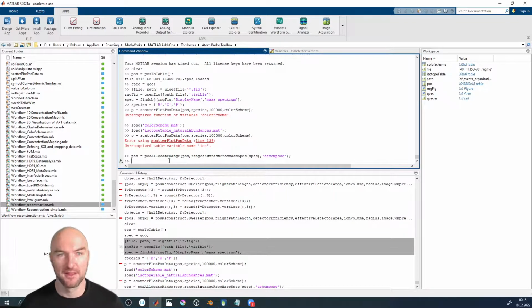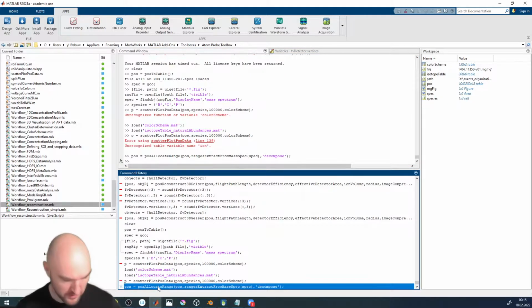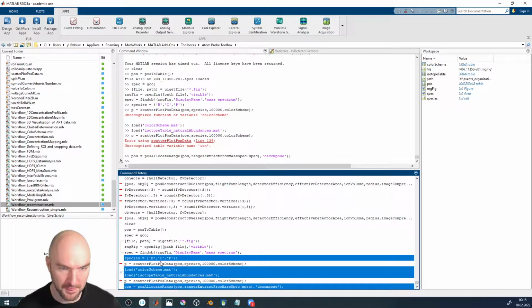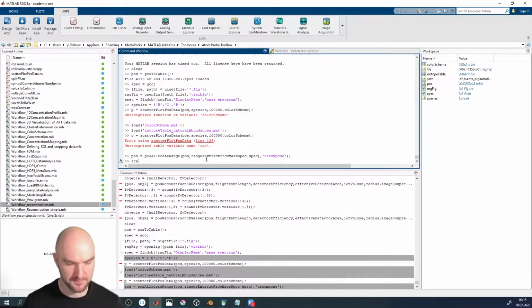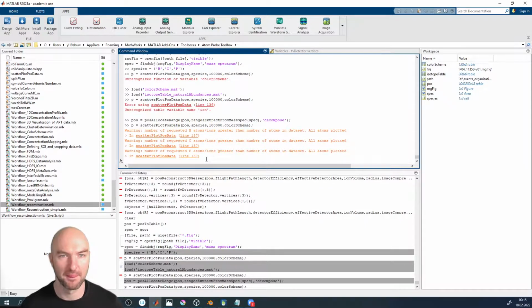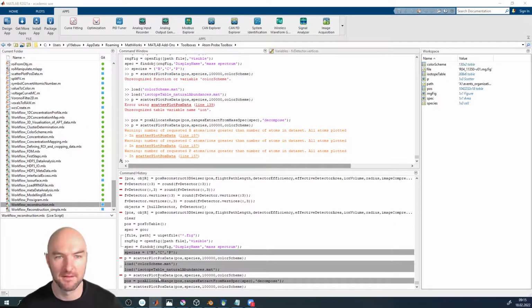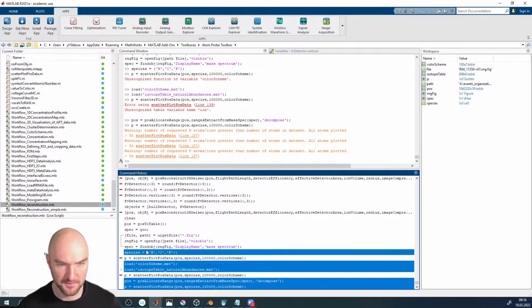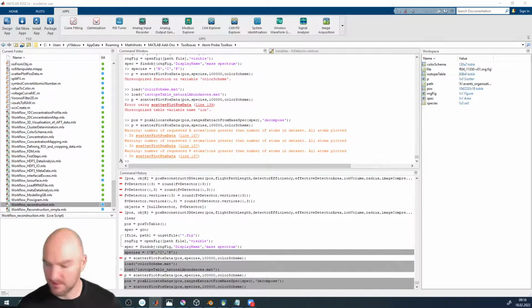So let me just run that and copy all of that into the chat. Oh, and I should have just plotted all of the atoms.